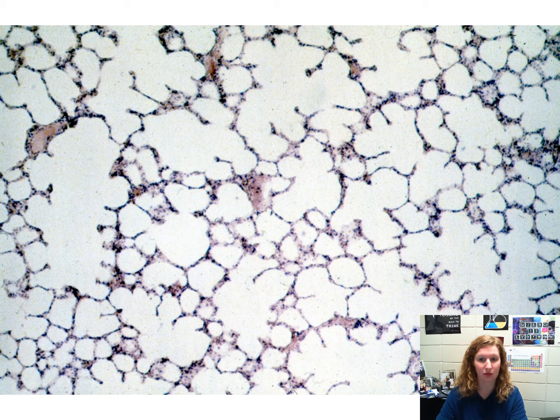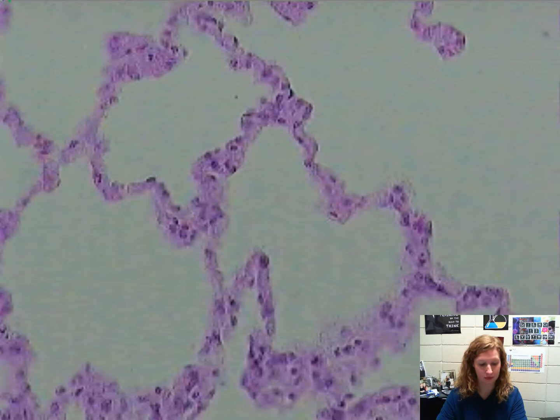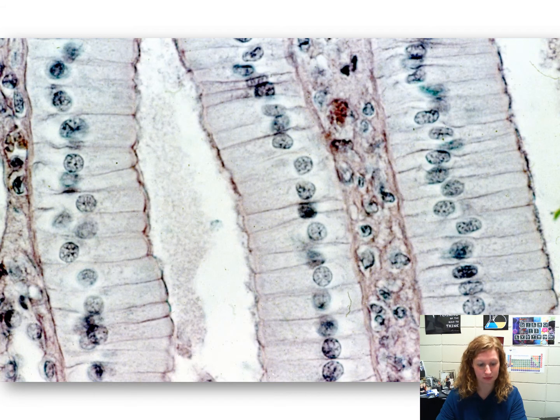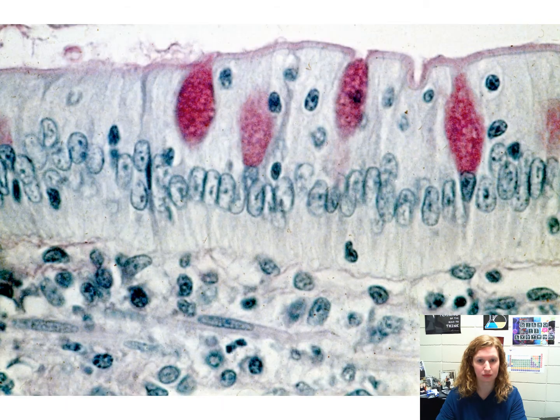Simple squamous epithelium. Simple columnar epithelium.